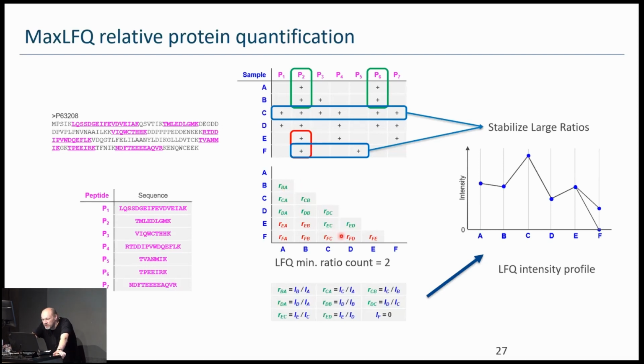And then there are some more steps to get back from this triangular matrix to just one profile. There's another linear regression model done to get back to the profile, but at the heart of it is basically estimating this triangular matrix of ratios.